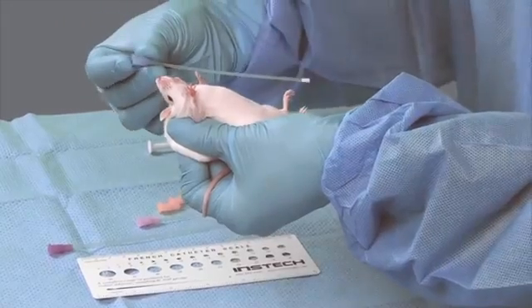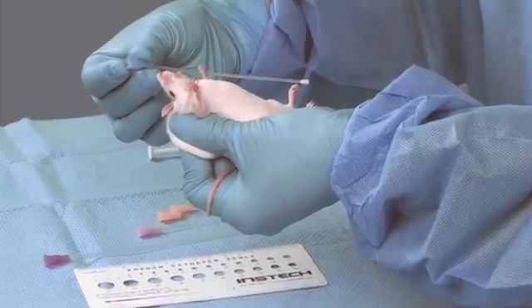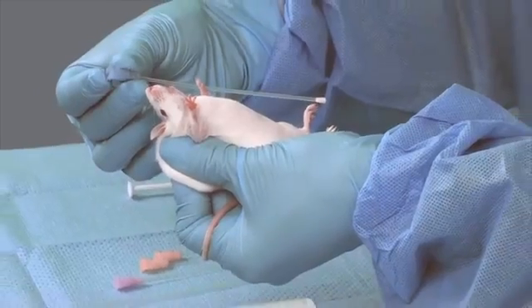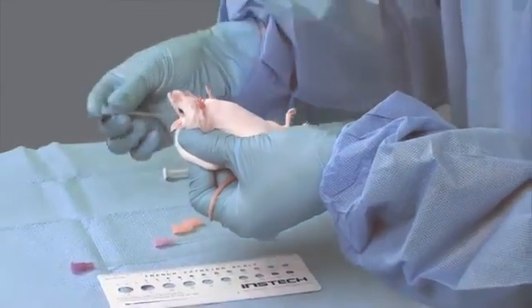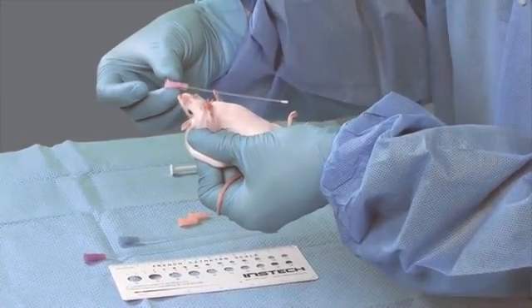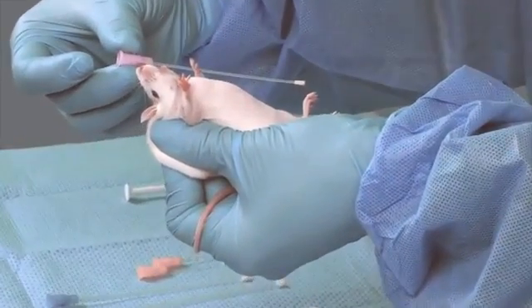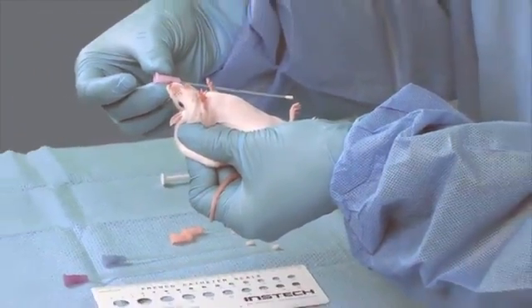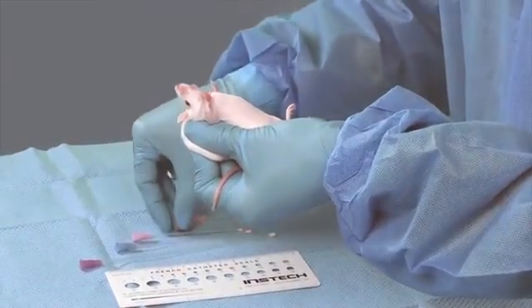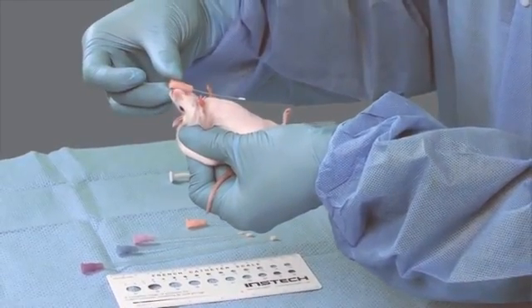If the tube is too short, contents could be aspirated. And if it is too long, the risk of perforation increases. The first two feeding tubes shown are too long. This last feeding tube is the appropriate size for this mouse.